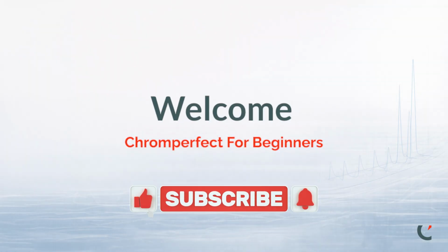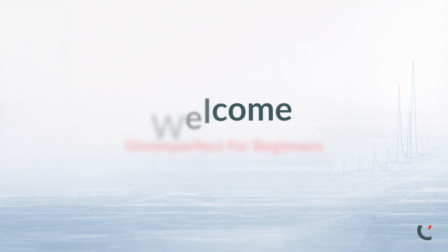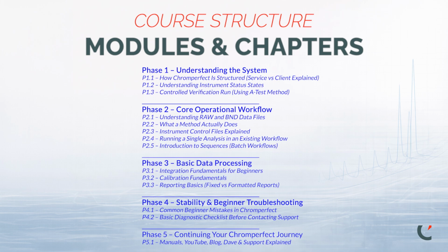This structured training program is designed for new users who want to become confident and operational with Chromperfect as quickly and clearly as possible. The series is divided into focused modules, grouped into logical chapters. Each module builds on the previous one, guiding you step by step through the core structure, workflow, and data processing fundamentals of the system.